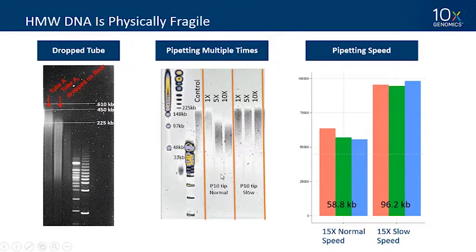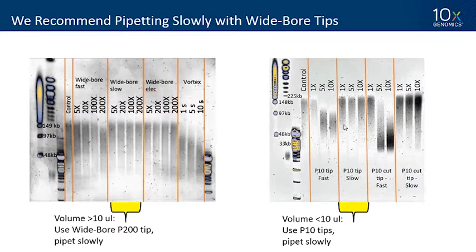If you pipette multiple times you can shear DNA. In a controlled experiment, we extracted DNA and at one step switched pipetting speed — mixing master mix 15 times either slowly or at normal speed. That one step can have a huge impact on DNA molecule length. All of that can be solved by pipetting slowly with a wide bore tip. If you're moving more than 10 microliters, use a wide bore tip; for less than 10 microliters, use the P10 tip slowly. Don't use the P10 tip if you don't need that accuracy — use a wide bore tip for mixing.